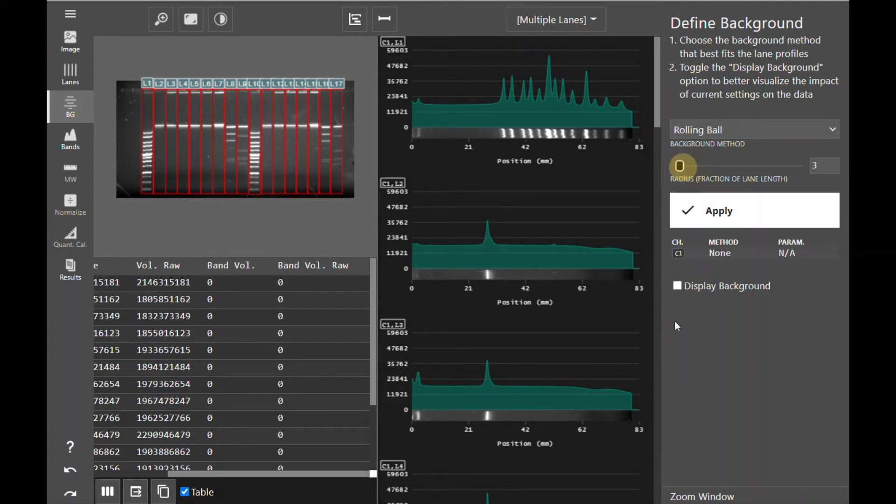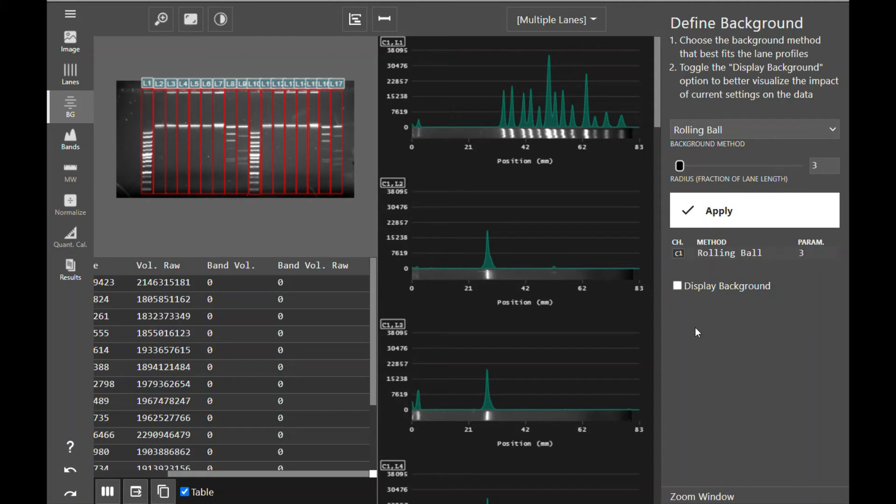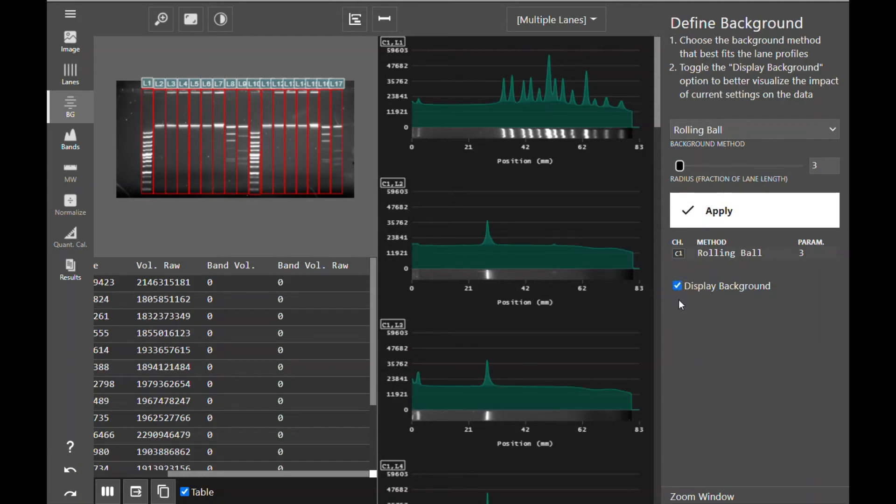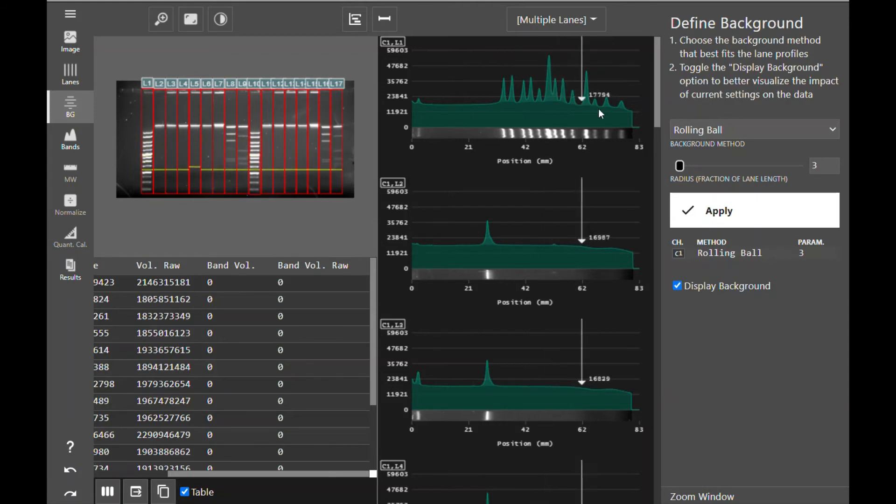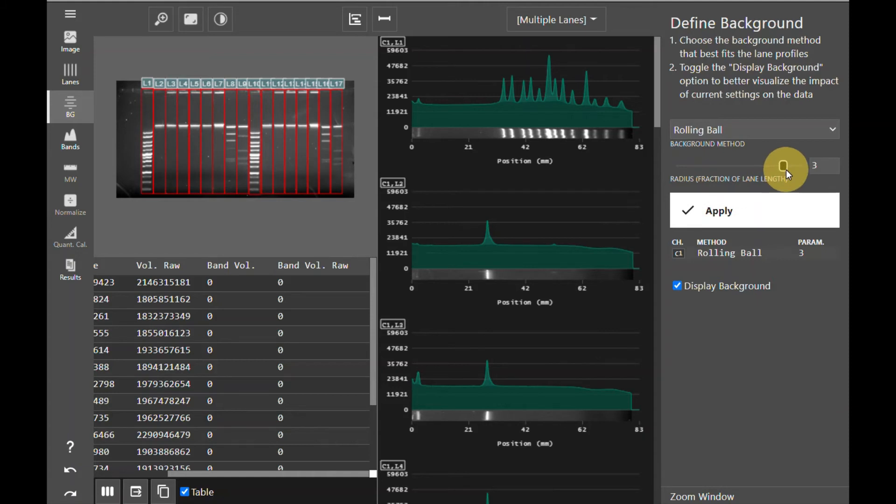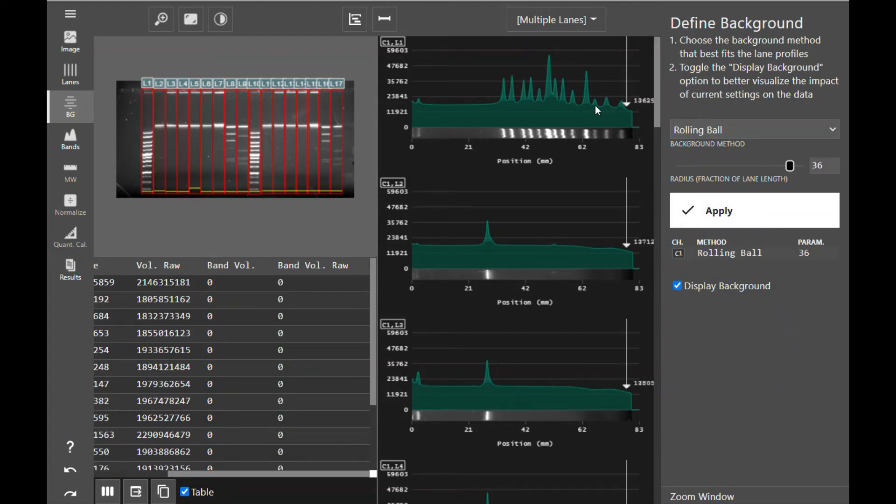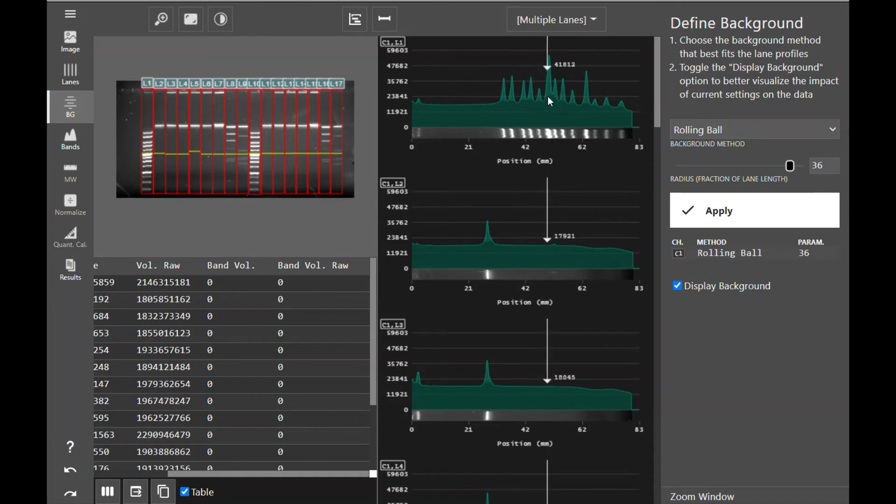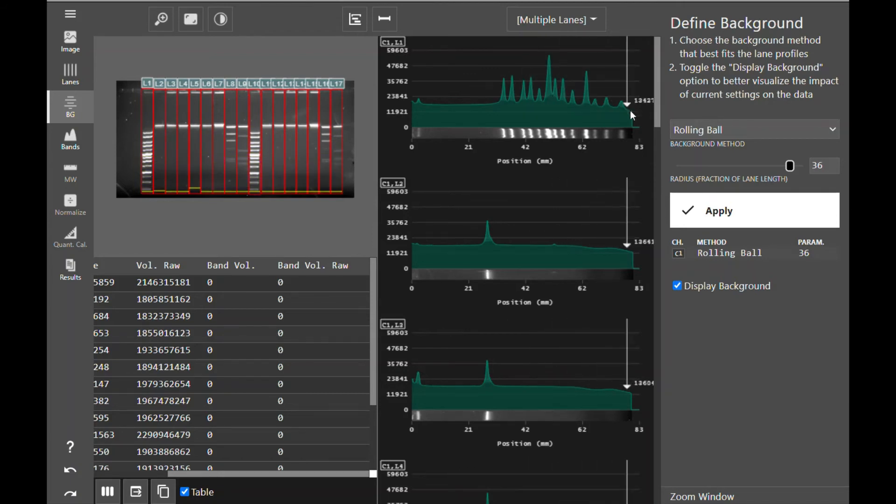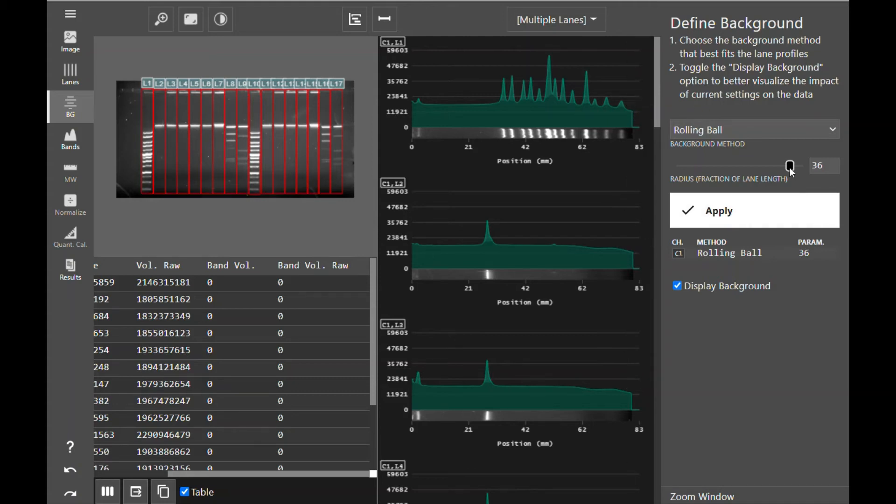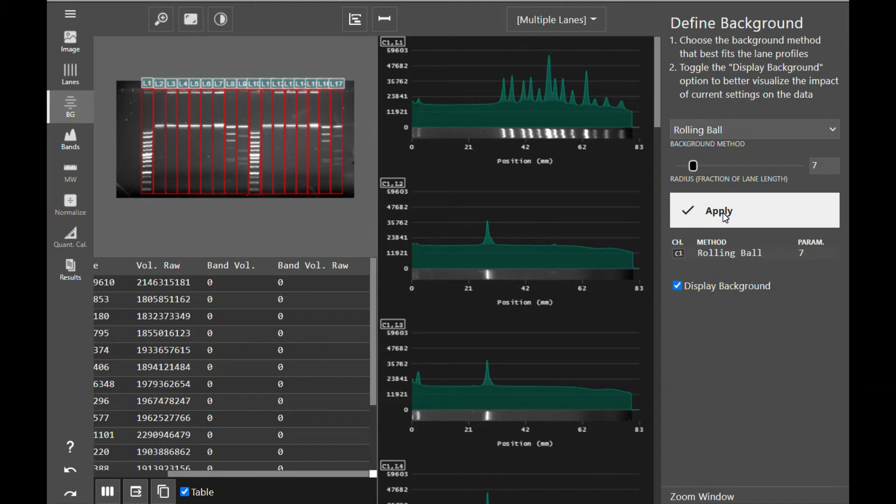For example, if I have a radius of 3, I'm going to apply that background method and I will display the background so you can see how that ball is rolling underneath all these hills. If I change that to a much larger number, so a much smaller fraction of the lane length and apply that, you can now see how that ball now falls into those hills of signal because it is a smaller ball.